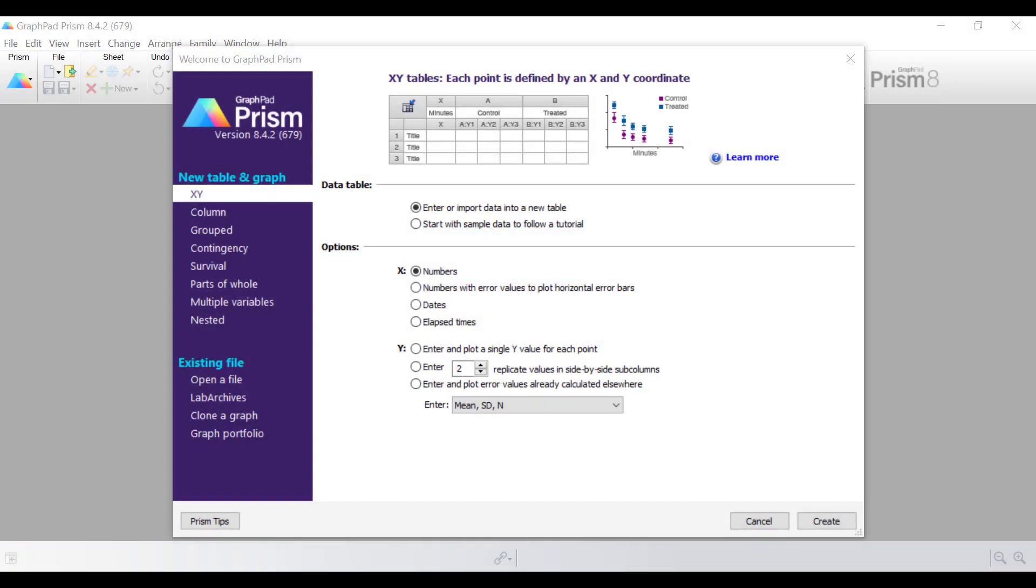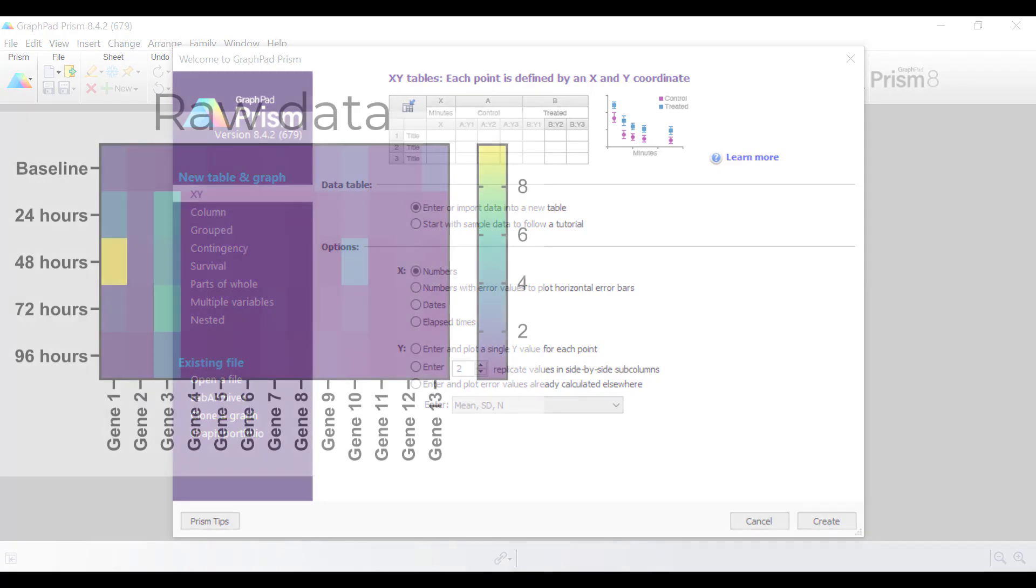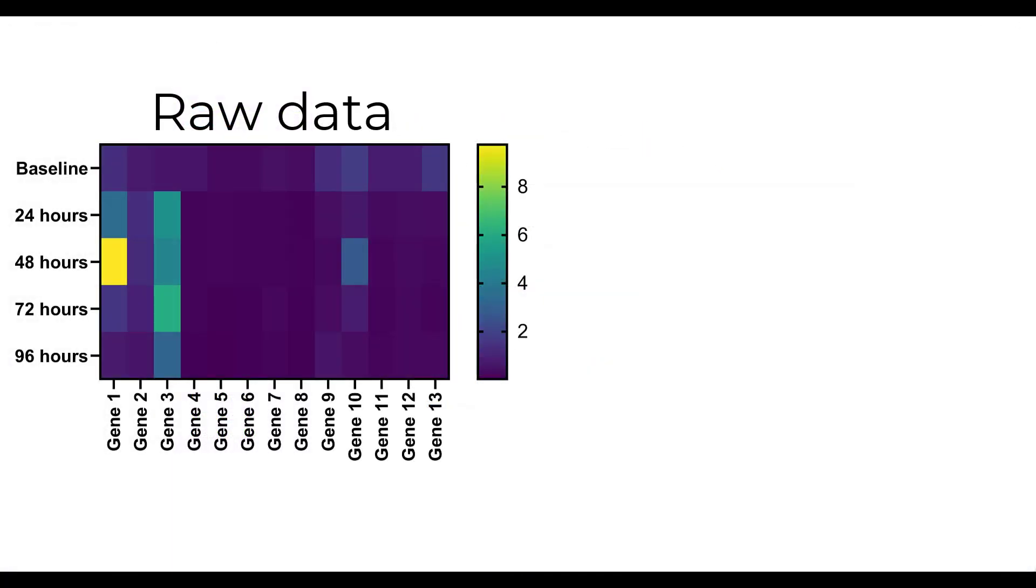Without normalisation, plotting raw data onto a heat map can make it difficult to interpret the results. For example, this heat map contains raw gene expression data over different time points following a stimulus.